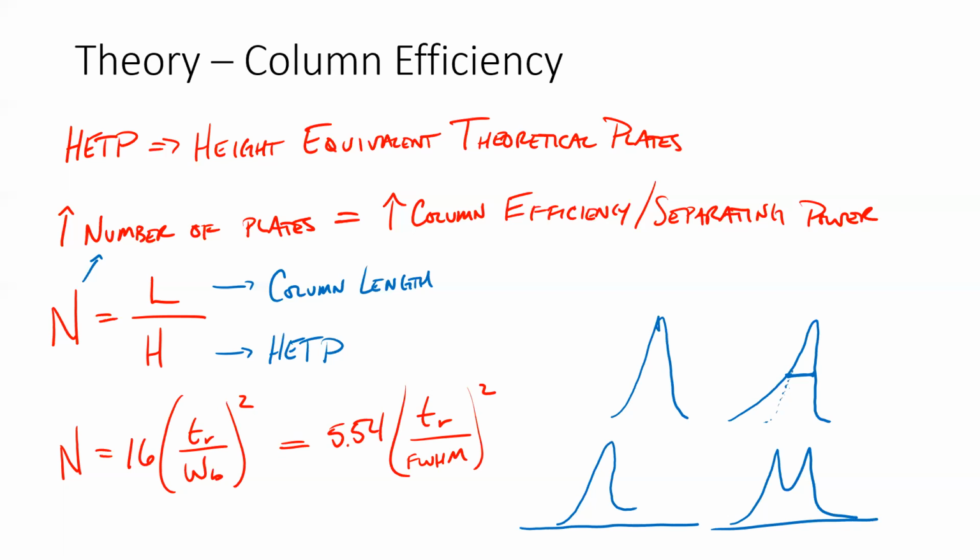So all of these are reasons why sometimes it's easier to use full width half max in chromatography than baseline width.